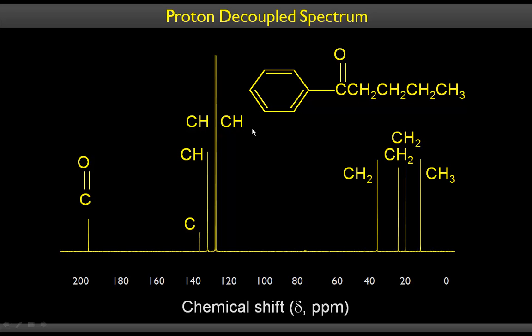Okay, so pretty much you don't need DEPT all the time. But if you have a complex compound or an unknown compound, then you need to take it. Now I know the structure. I know the atoms attached to each one of them, so I can probably go by chemical shifts and assign. But out of these three methylenes, you're not sure which one is which. We only know that these are methylenes because the chemical shifts are much higher than methyls. Okay, and these are aromatic.